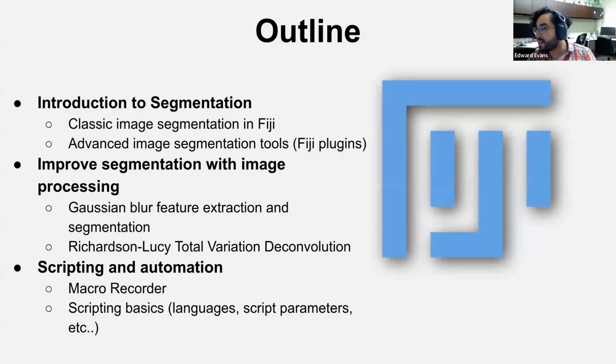Okay, so what are we doing today? Today we're going to talk about segmentation in Fiji. This presumes that you already know what Fiji is, you have it installed, and you know how to open up an image and look around. So we're going to work with classic image segmentation first, and then I'll show you some advanced plugins that you can play with to segment your images.